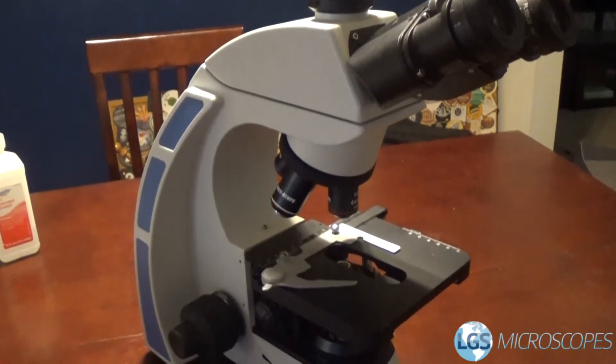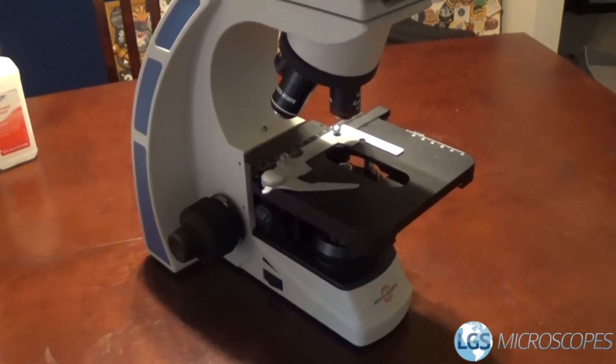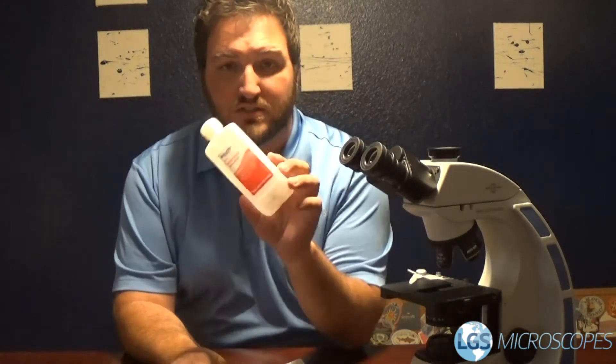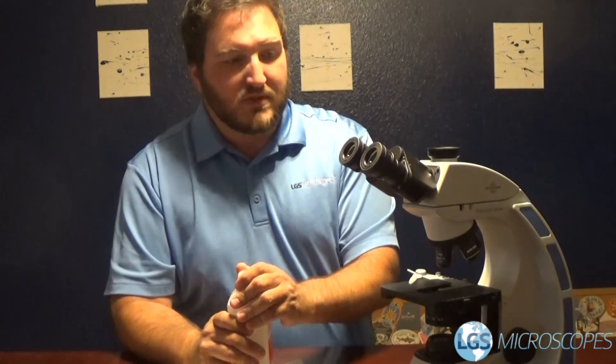So we're going to go ahead and go through how we can do a little bit more thorough cleaning. We're just going to take our paper towel and just regular isopropyl alcohol — this is 91% — and we'll just go ahead and wipe this down.